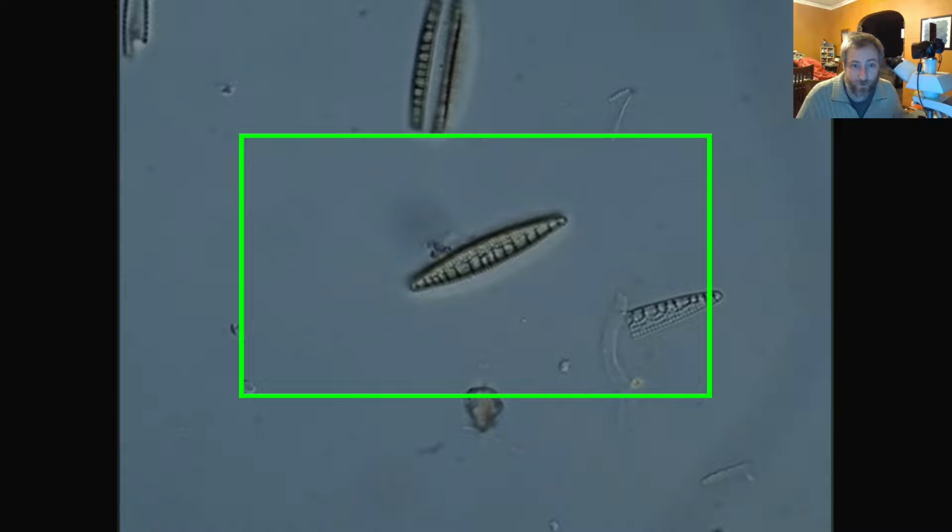So, where are these diatoms from? These are diatoms that were collected from a power plant in Idaho, and my friend Anna sent me these. These are the ones we were looking at on the SEM on Saturday for the Gomphonema monster. It's the same sample, except now we're looking at it in the light microscope instead of the SEM. And we'll probably look at some more tomorrow.